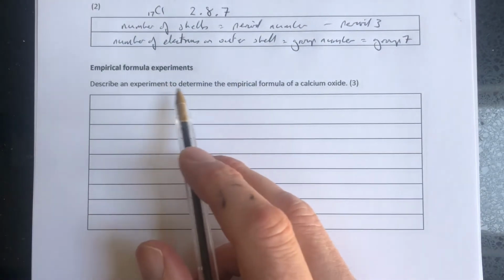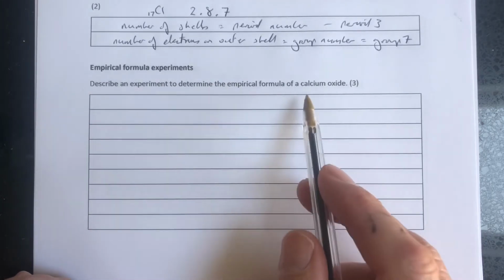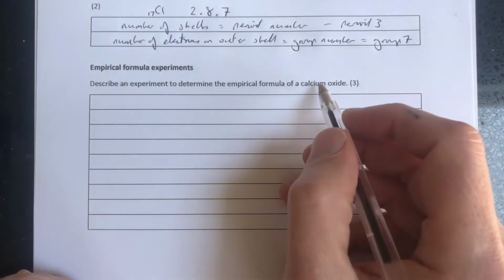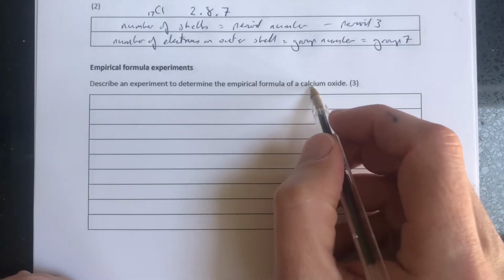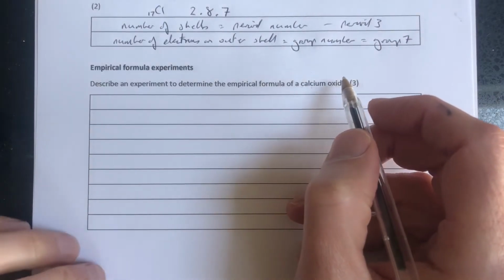An empirical formula experiment. How do we do an experiment to determine the empirical formula of something like calcium oxide? Well, empirical formula, that is the simplest ratio of, in this case, calcium to oxygen. So we need some measurements about the mass of calcium in calcium oxide and the mass of oxygen in calcium oxide.